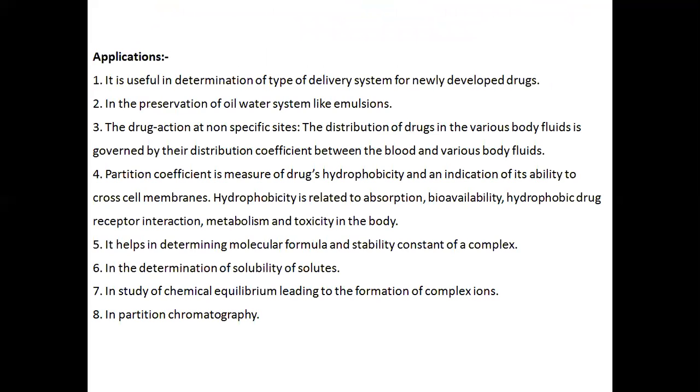Applications. It is useful in determination of type of delivery system for newly developed drugs, in the preservation of oil-water systems like emulsions, the drug action at non-specific sites in that the distribution of drugs in the various body fluids is governed by their distribution coefficient between the blood and various body fluids.